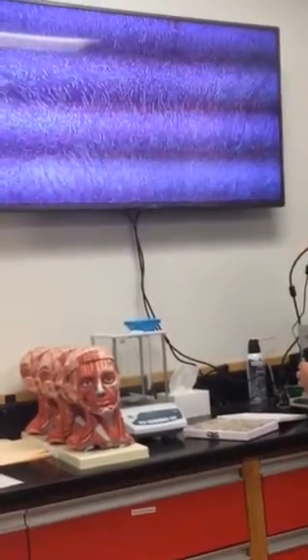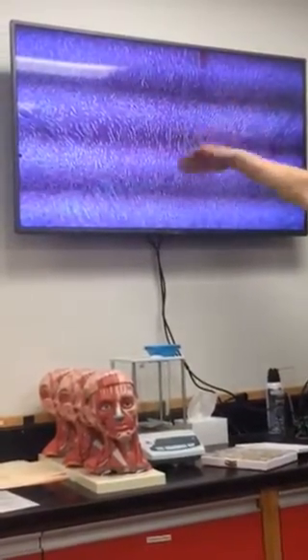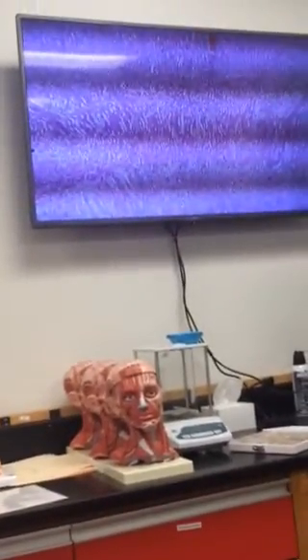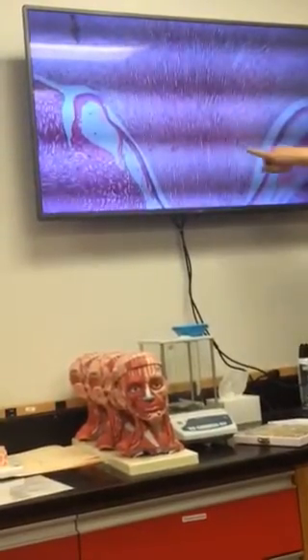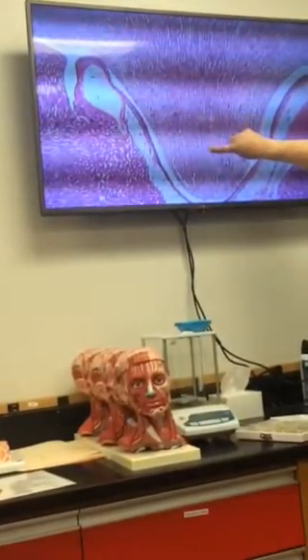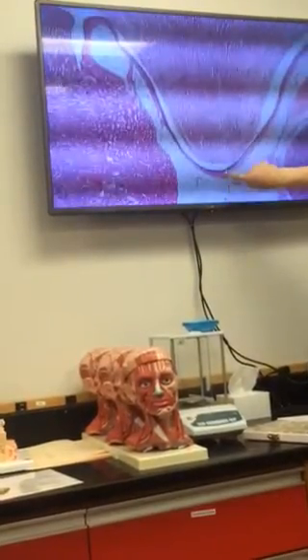Now this is the medulla, and what are those kind of parallel running tubes? They would be loops of Henle, either ascending or descending limbs of the loop of Henle, or collecting ducts. And then if you go far enough, you can see down here, what is this right here? Papilla. There would be a papilla, and you can see in all likelihood, you see those tubes coming down? They're going to exit right at the tip of that papilla.